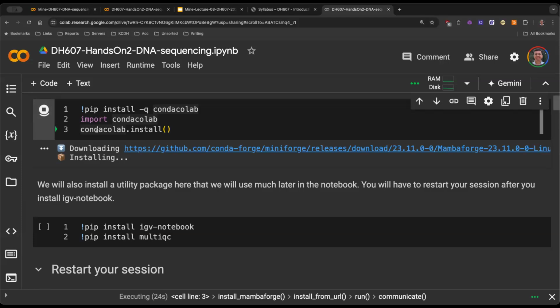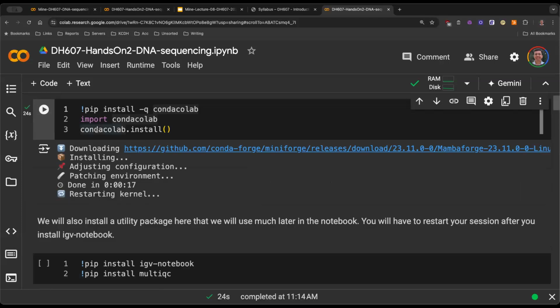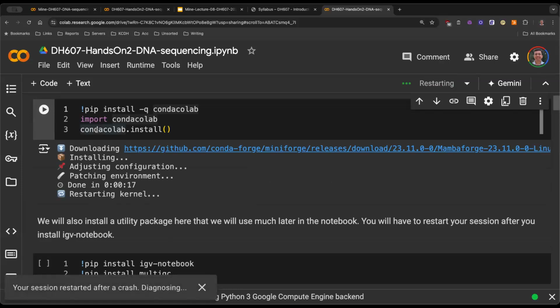So we'll hopefully not run into network issues. The other reason to choose Colab was that the Colab servers, at least some of them, are hosted on the US side. And the data set that we're going to download is also hosted on US servers. So downloading on Colab is faster than downloading on the IITB network. Does that make sense?